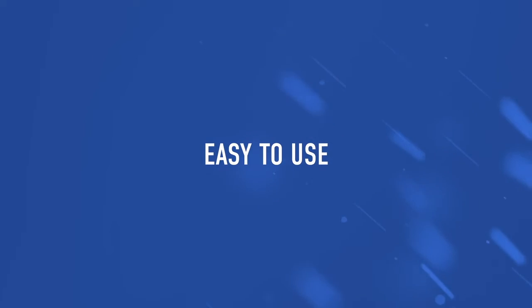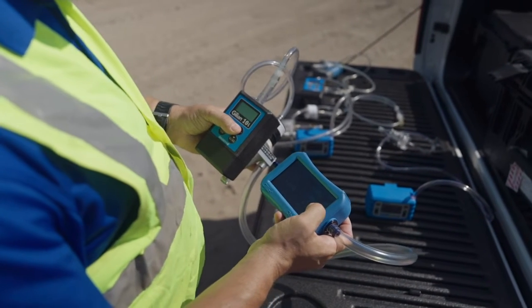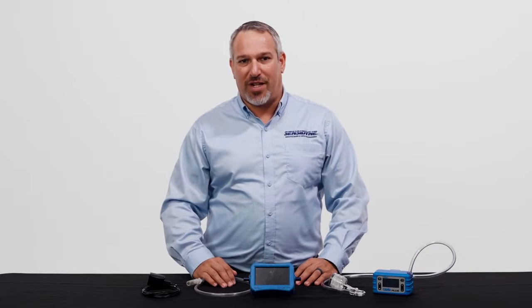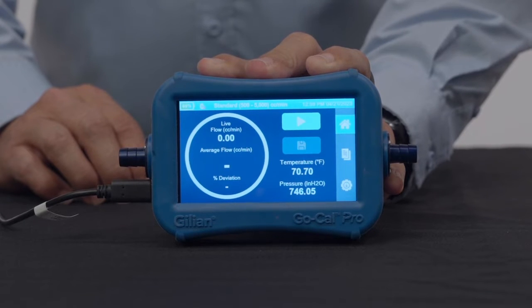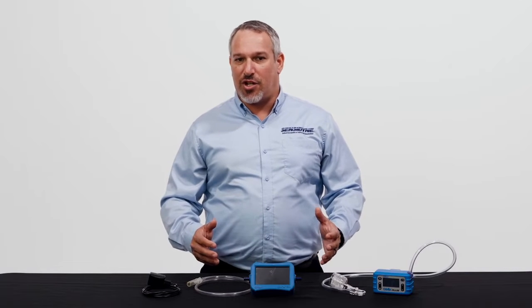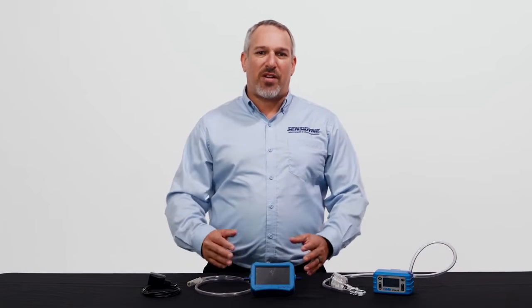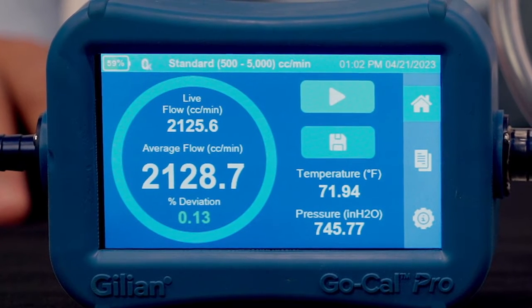Next, I'd like to talk about the ease of use of the instrument. Setup is easy — simply power on the unit, connect your sample train, start your pump, and live readings will appear on the screen. The meter also features a color touch screen display, allowing for easy viewing and user interface. Fast stabilization occurs, allowing instantaneous readings to be displayed. A button on the screen also allows the user to take advantage of flow measurement over a user-selected timeframe. The user may also customize for local languages and preferred units of measurement.